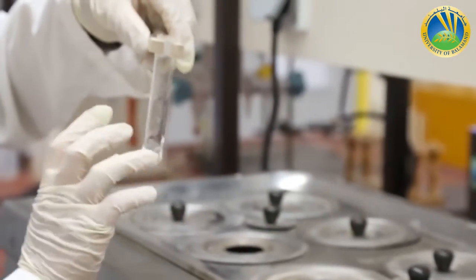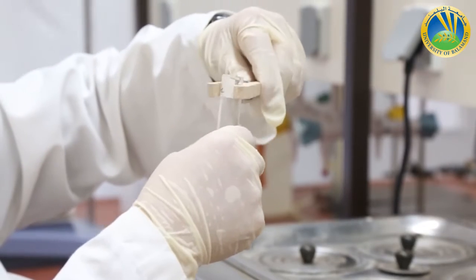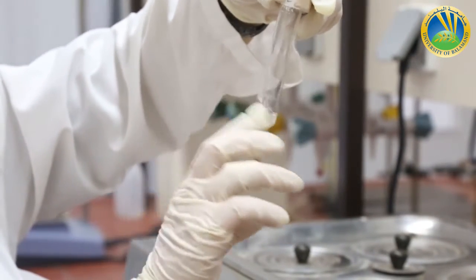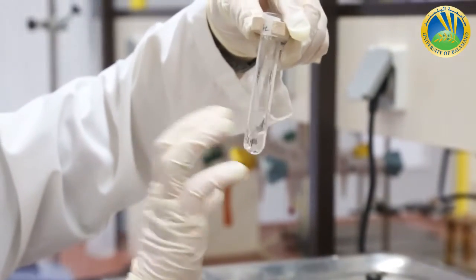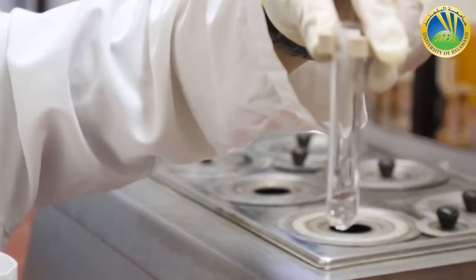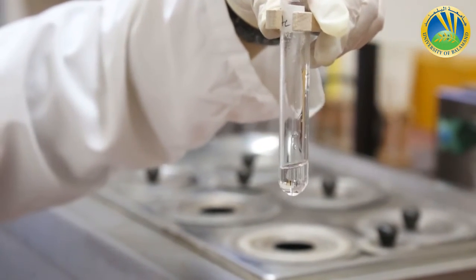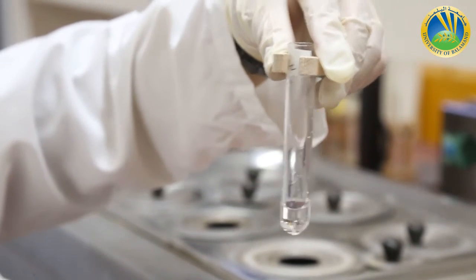Let me now check the stearic acid. The granules are about to disappear. There is no more granules inside the liquid. Now I can say that stearic acid is soluble inside acetone at hot temperature. We are done with the test with acetone.